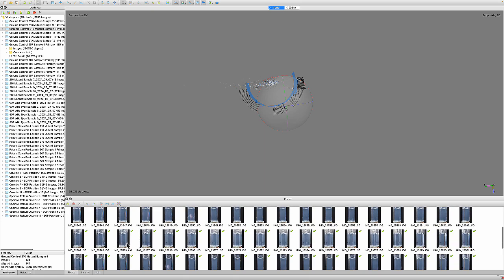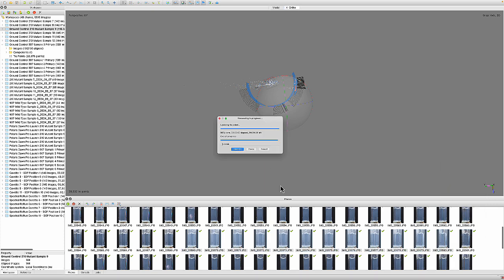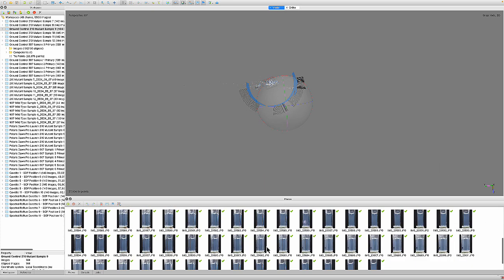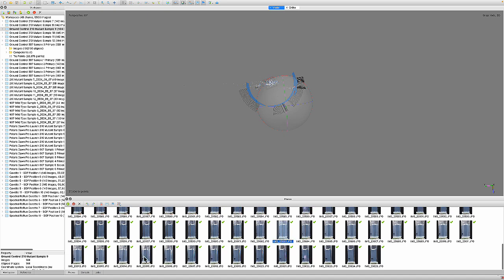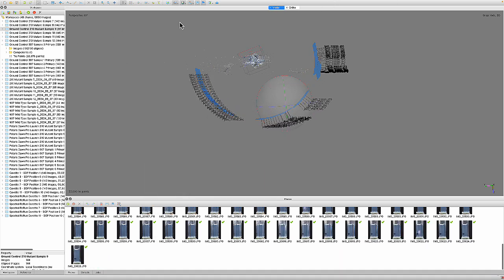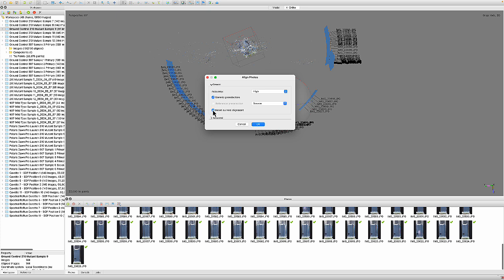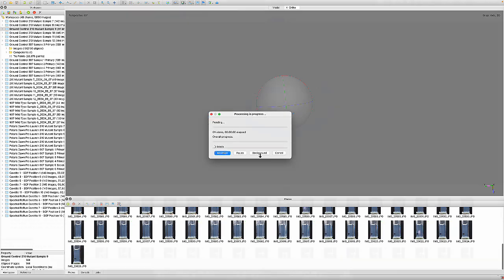Here we go. So at this point we're starting to see the cuvette from its corner. We'll remove those images. And likewise, right about here we're looking at it as a corner as well. So we'll remove those. Now, if ever you have a model that didn't come out too great, what we're going to do is go back to Workflow. We're going to realign those models, reset the current alignment, and align that one more time.